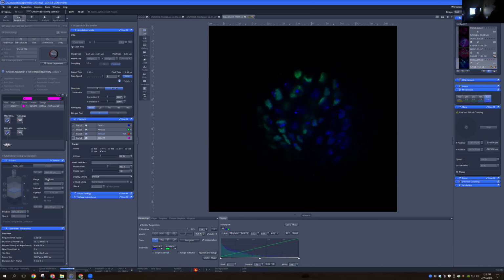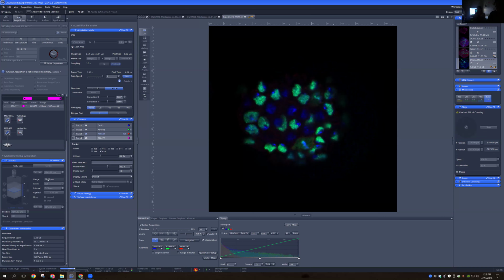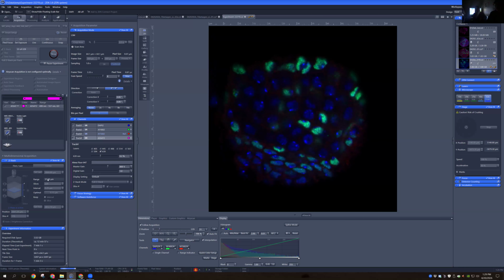Yeah. And the reason why the Z stacks have to be so close together and so many of them is actually, Raja, exactly what you were saying with the model clumping things together or separating things apart when it's actually one. It's called Z resolution, basically how finely resolved the image is in the Z direction. Very thin slices allow the Z resolution to be very high, which means the program has a lot of information as it tries to decide where one cell stops and the other starts.